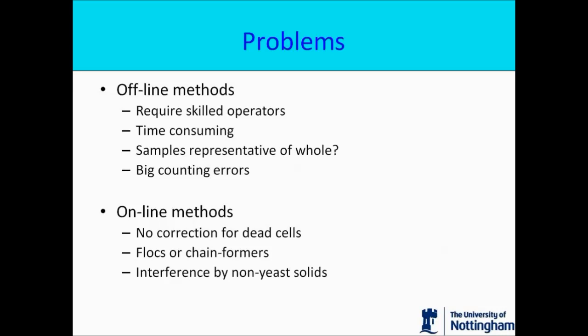You may have even more problems if you have yeast strains that may form very large flocs or may even possibly grow in the form of chains. So looking at those methods as a whole, it's clear that all of them have quite marked, quite big shortcomings.